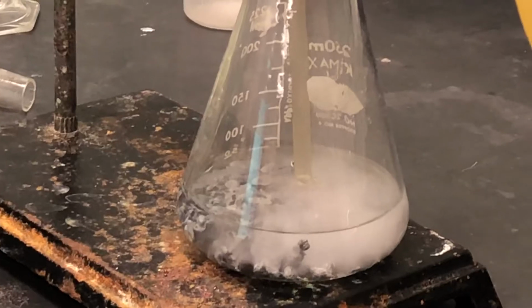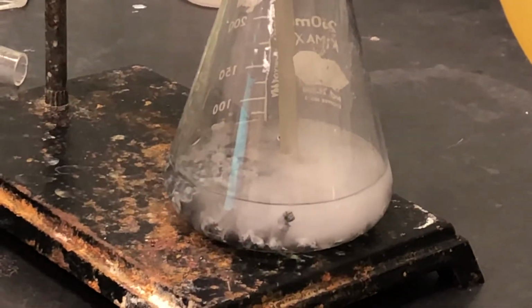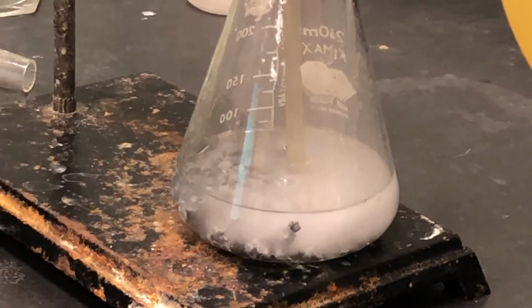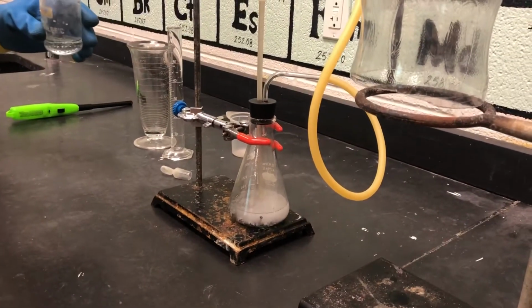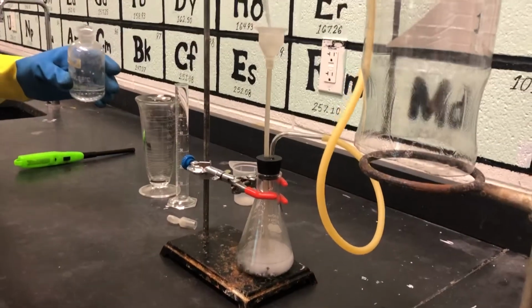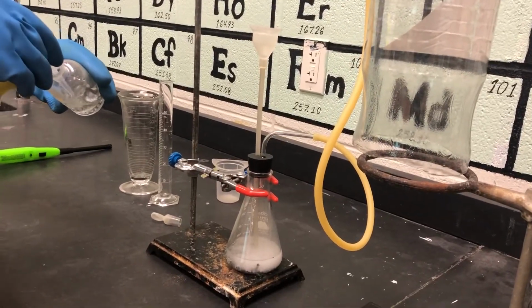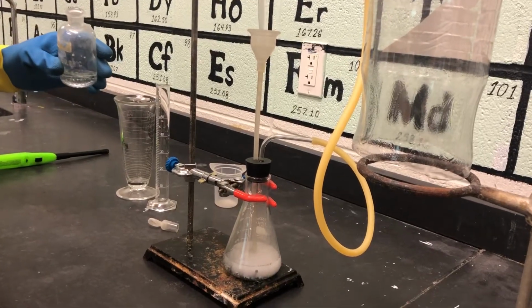Now, another thing that I haven't shared with you yet is I'm using used zinc. What I mean by used mossy zinc is it has been used before, so a lot of the dust has been removed, so I don't get a reaction that is so rapid that it can actually splatter through this one.